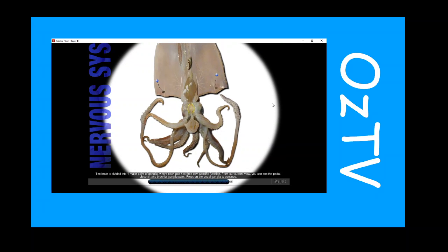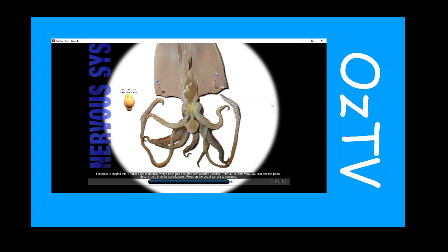The brain is divided into four major pairs of ganglia, where each pair has their own specific function. From our current view, you can see the pedal, visceral, and brachial ganglia pairs. Press on the pedal ganglia to continue.